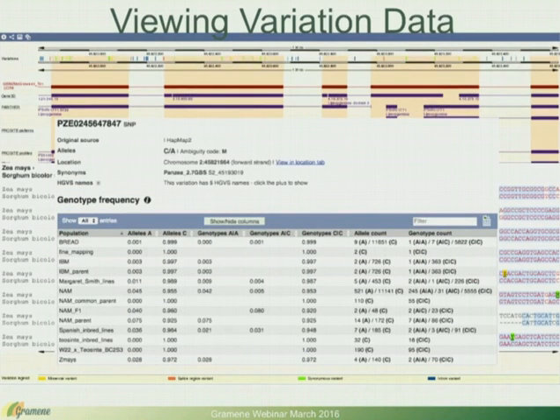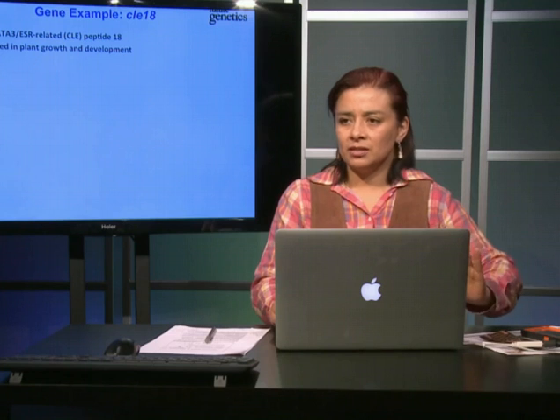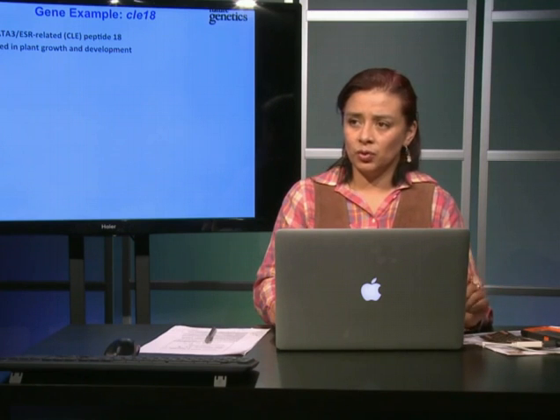And finally, this is just one table where you can see the population frequencies, in this case for genotype, and also alleles. Okay, the example that I'm going to use to show you, I'm going to use screenshots to show you step by step how you can get all of the images similar to the one that I showed you before.